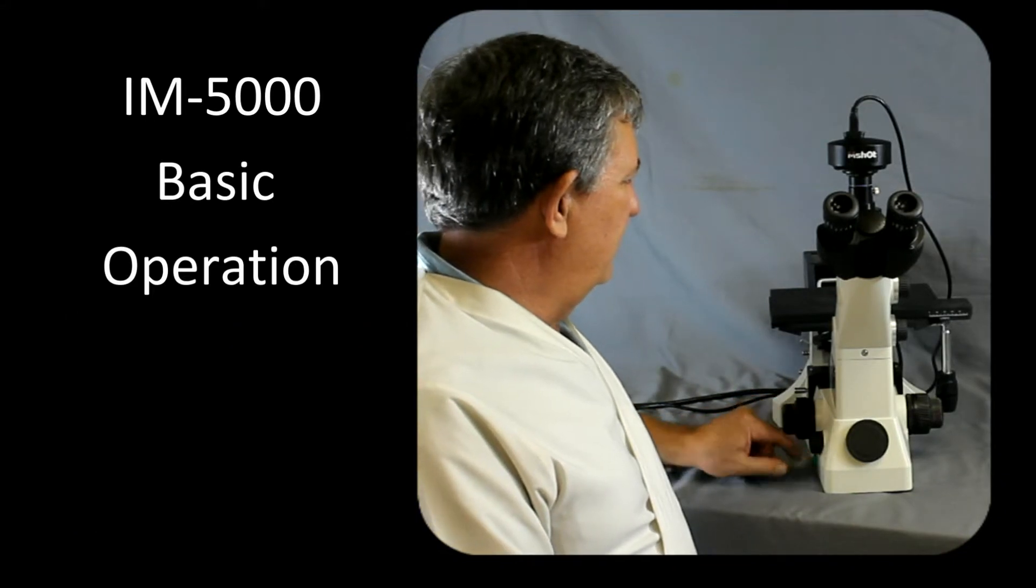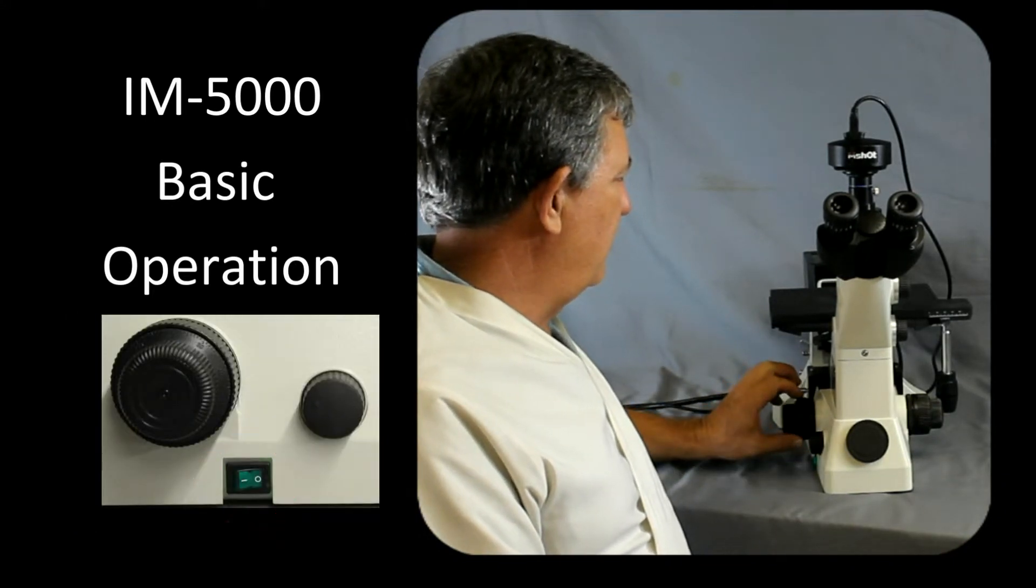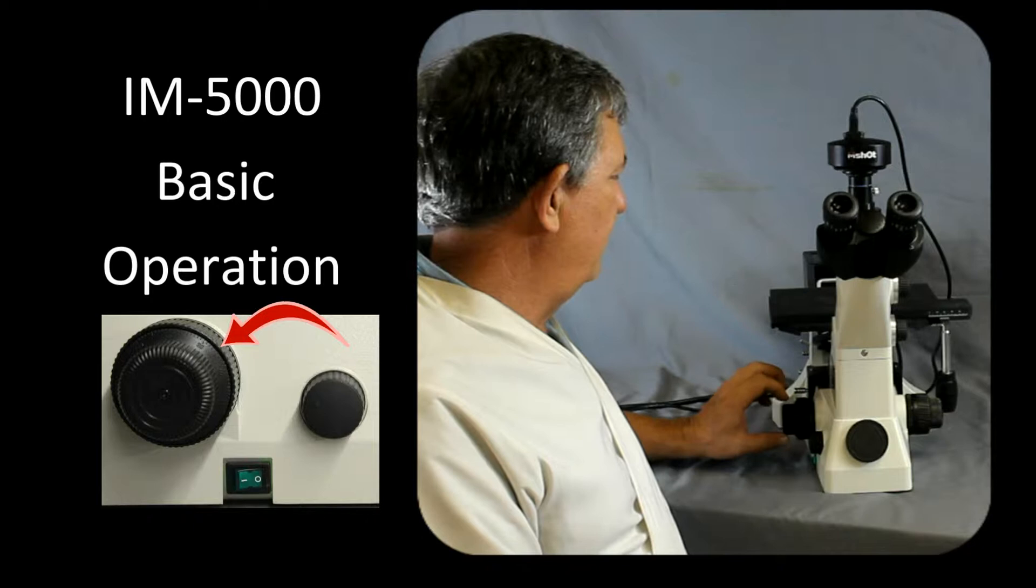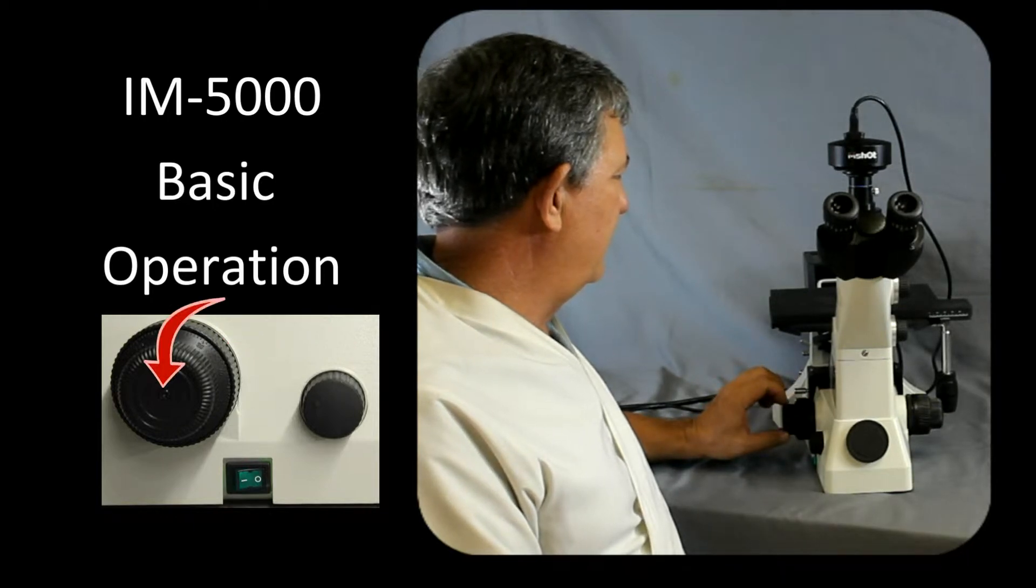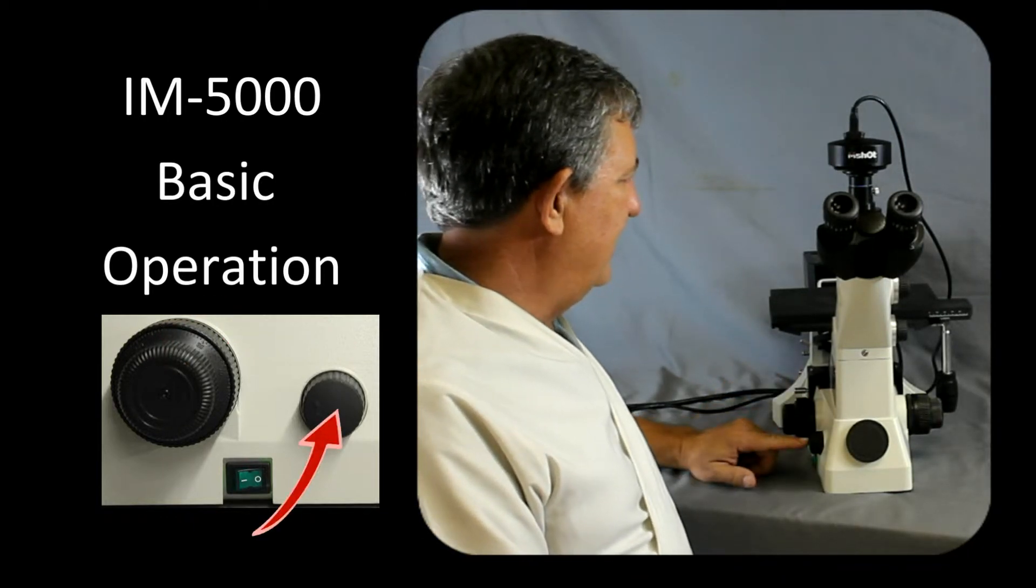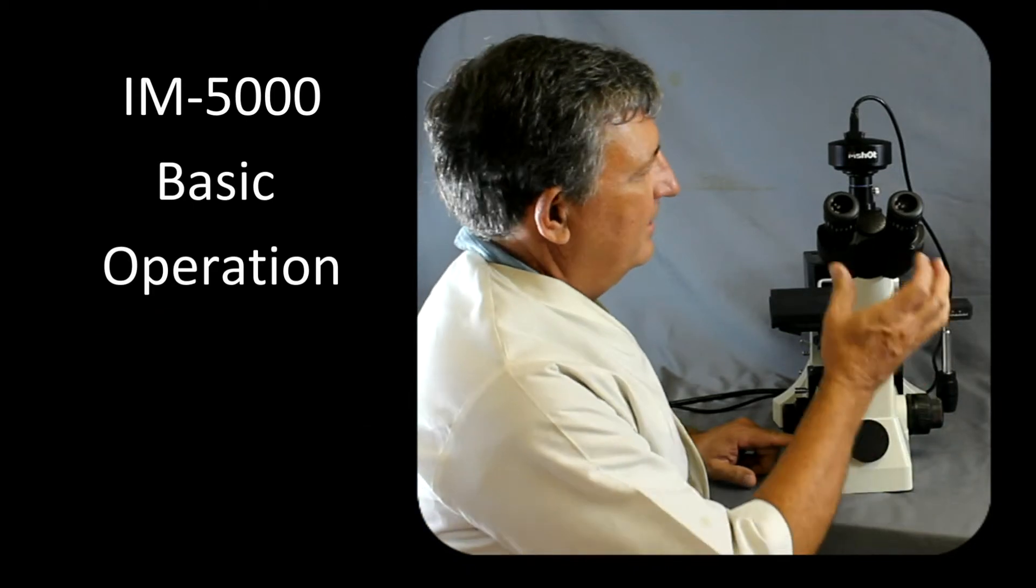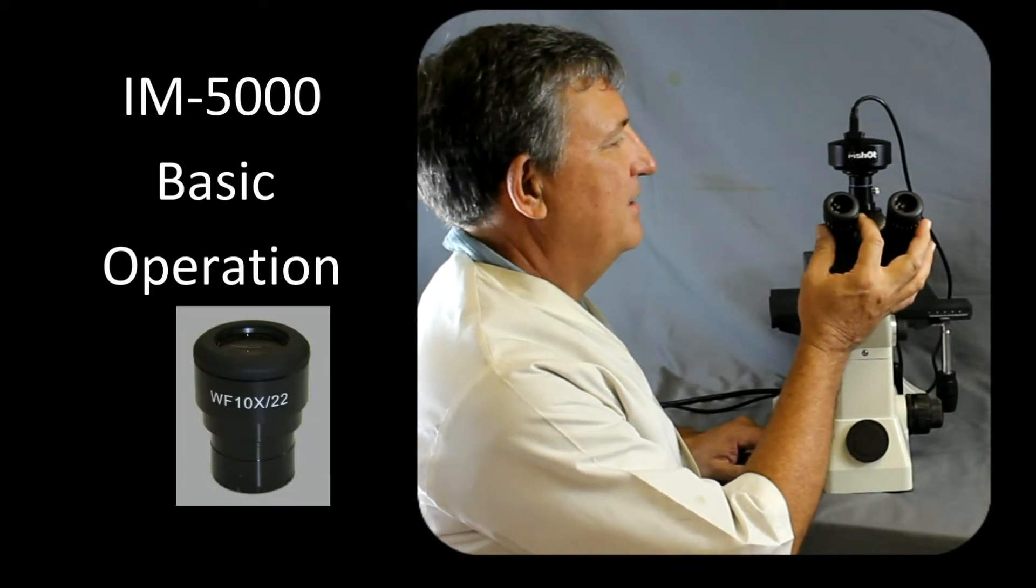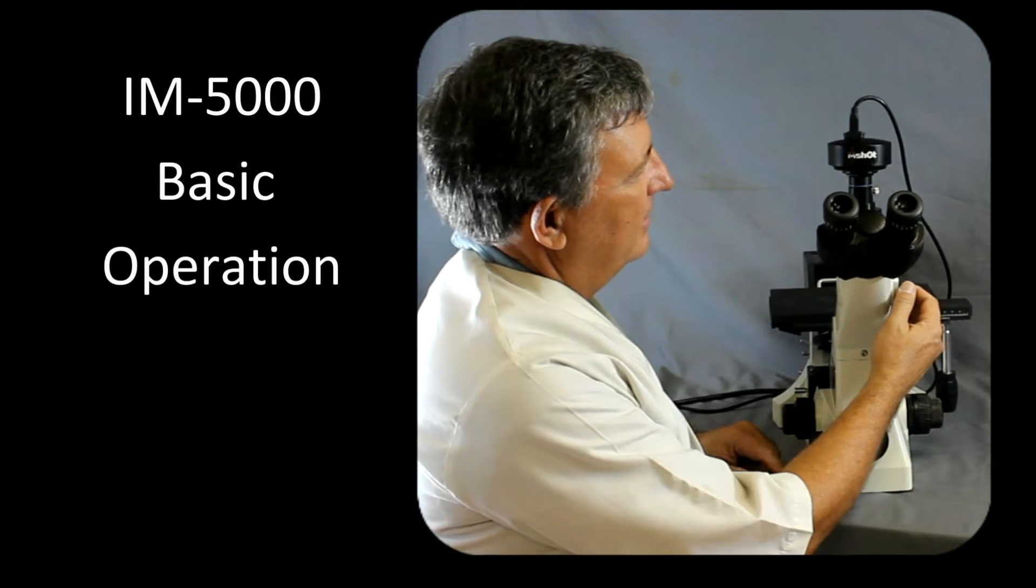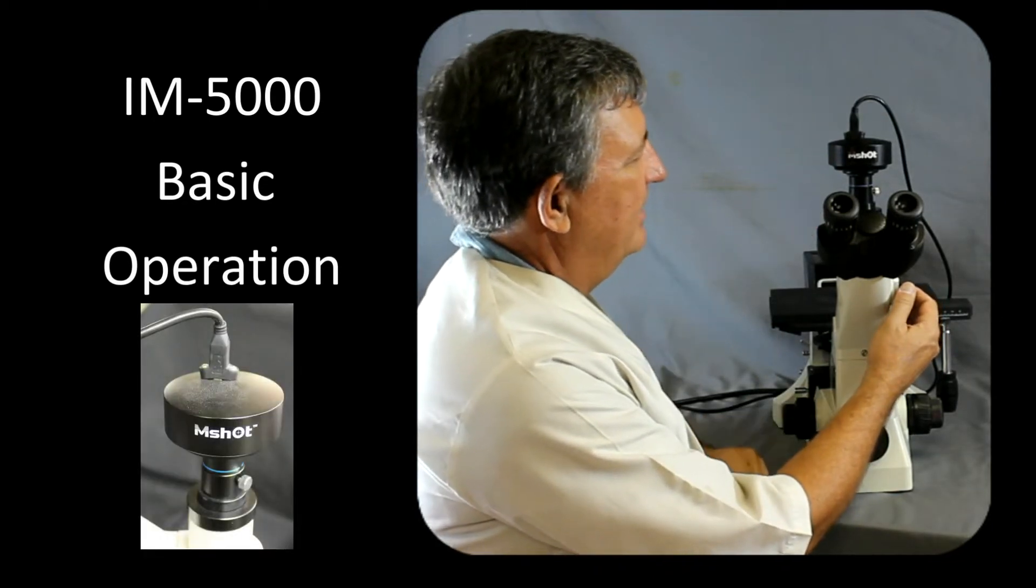Some of the other features include the on-off switch, coarse focusing with the larger knob, fine focusing with the smaller knob, light intensity control, 10x eyepieces, and a digital camera can be added.